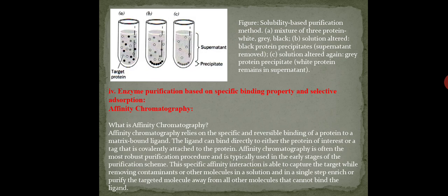Because solubility gets less. Here the solubility becomes less, and the salt concentration automatically becomes less, because when proteins come together, as I told, unity is the strength. So when protein comes together, automatically solubility has been decreased and which helps to stabilize the structure of protein more. So solubility gets less and proteins are precipitated, that is proteins get separated, they come down.